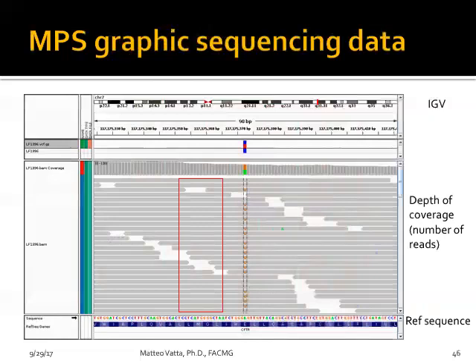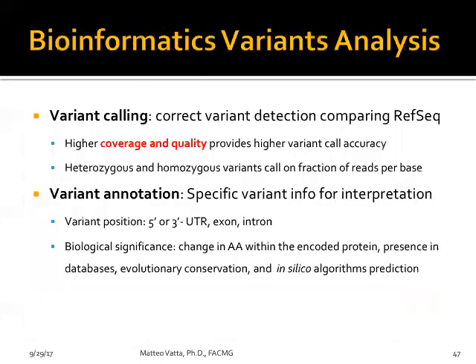It is very, very important to always make sure that you have reads from both sides, from both directions. It's a bad sign when all the reads are coming only from one direction. Usually they're not acceptable clinically. It's particularly bad if all the variants are from one strand. Correct. But even if all the reads are coming from one strand, you want to see reads coming from both strands anyway. No, for your PCR-based assay, sometimes it's not possible, right? So if your capture part is using PCR, then for this end, you can only have one direction.